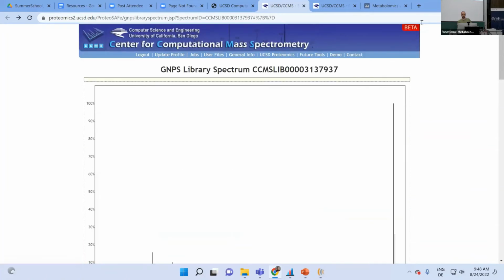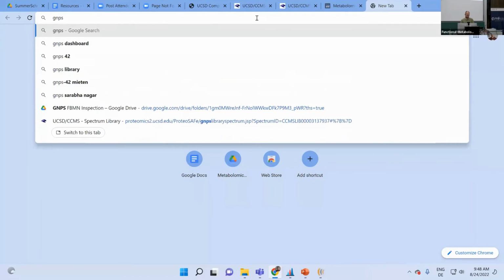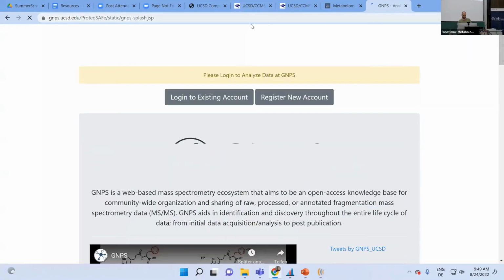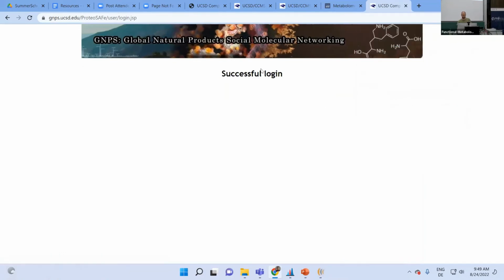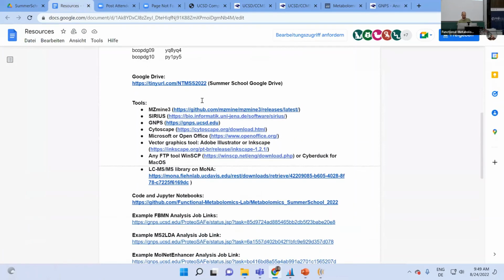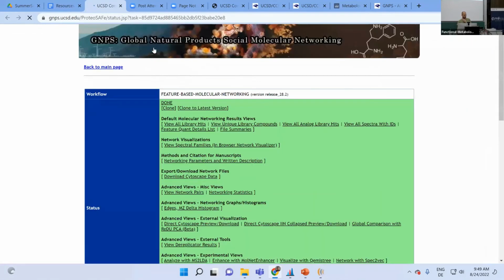Because you went to this through GNPS. I'm just going to open up the link we shared with you, so it's not on proteomics 2.